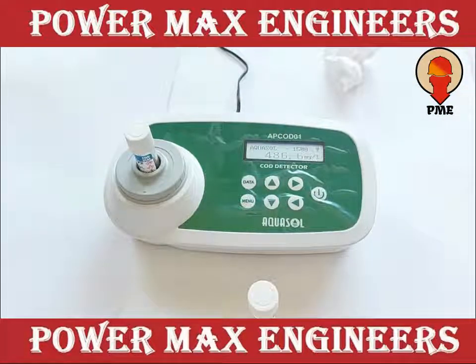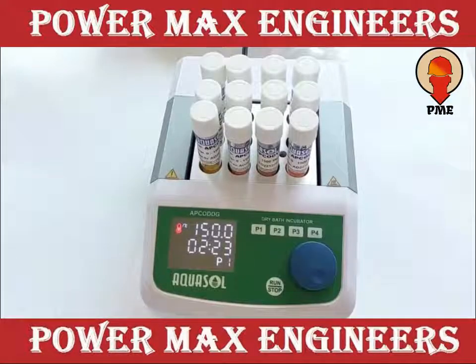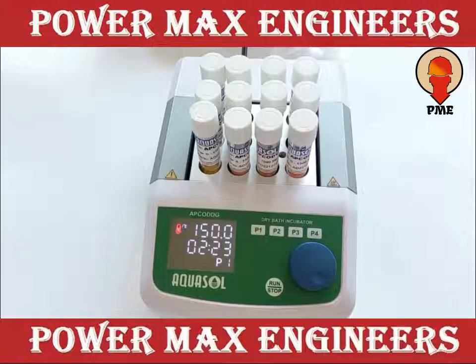486.6 mg per litre COD is present in this sample. At the same time, you can test 11 different samples with one blank.